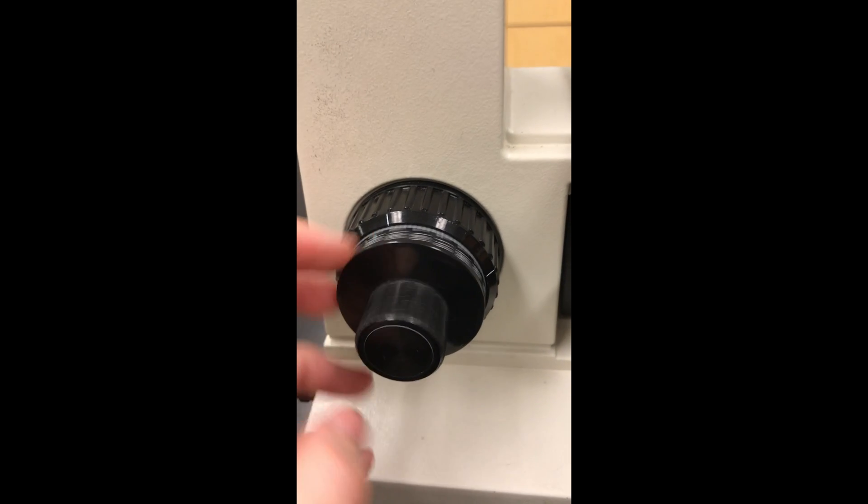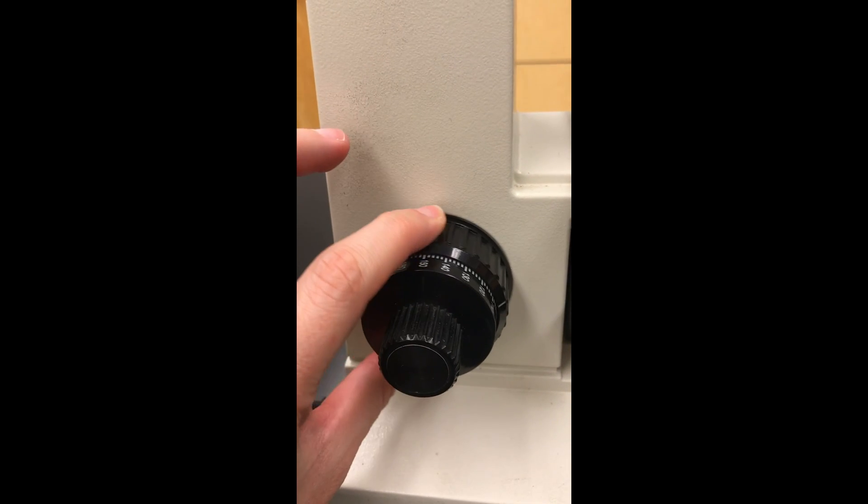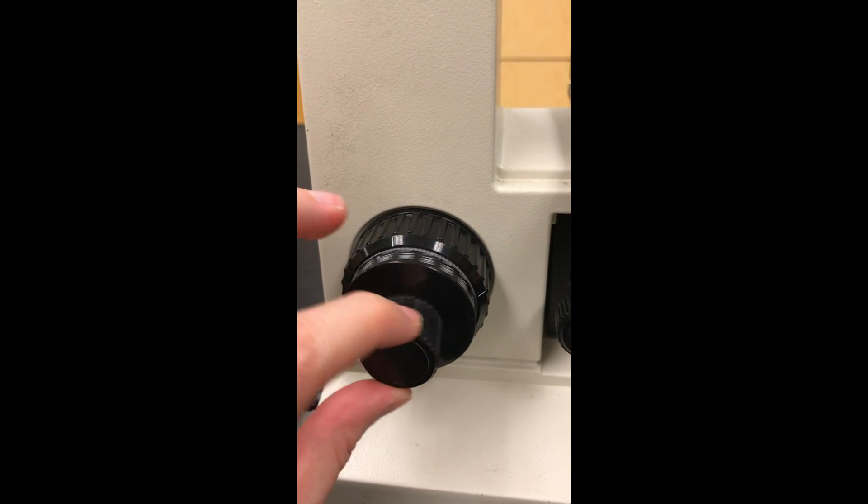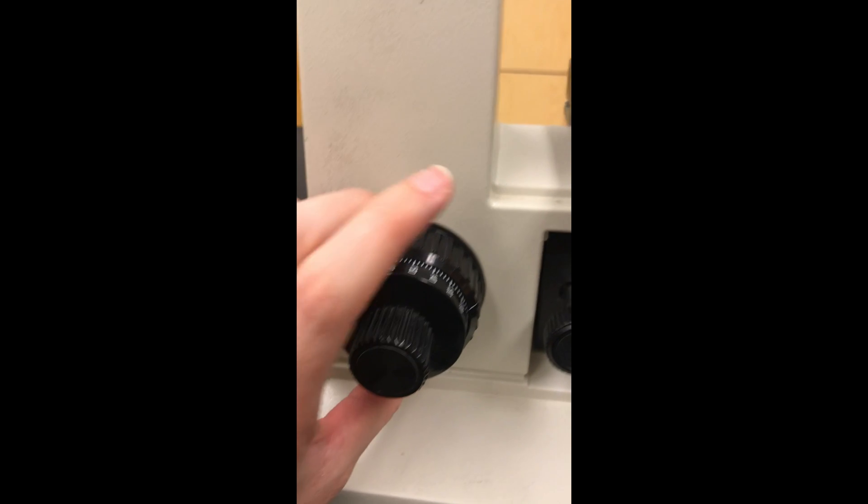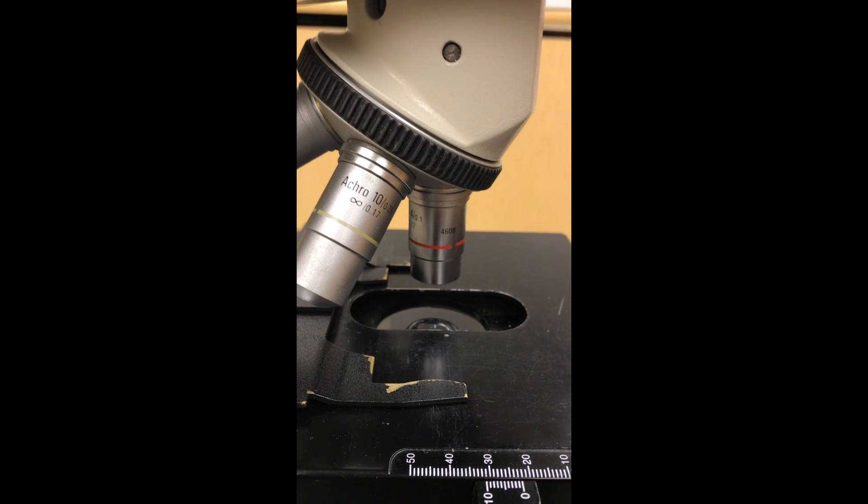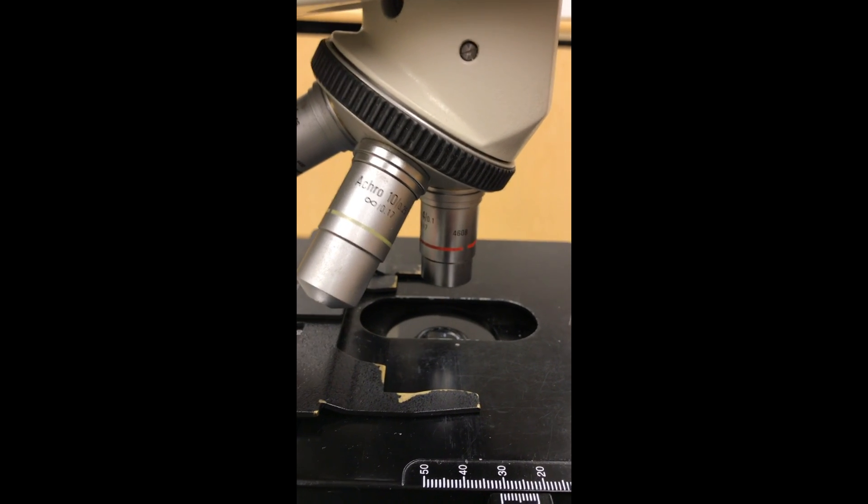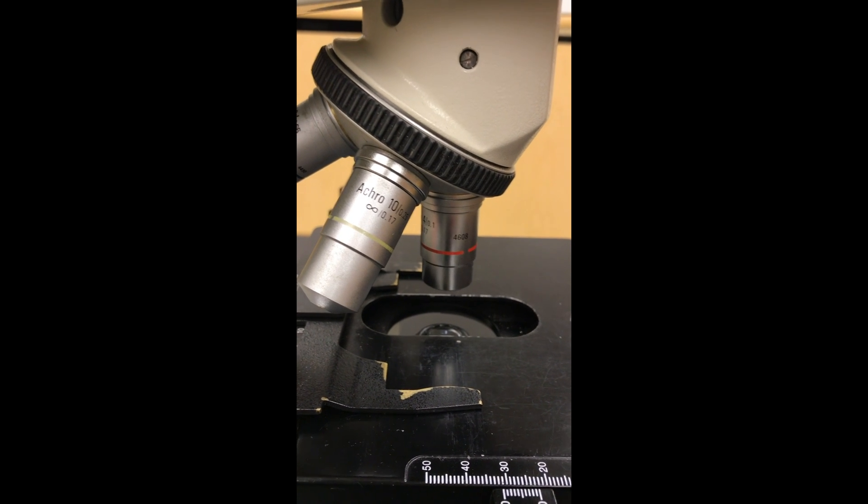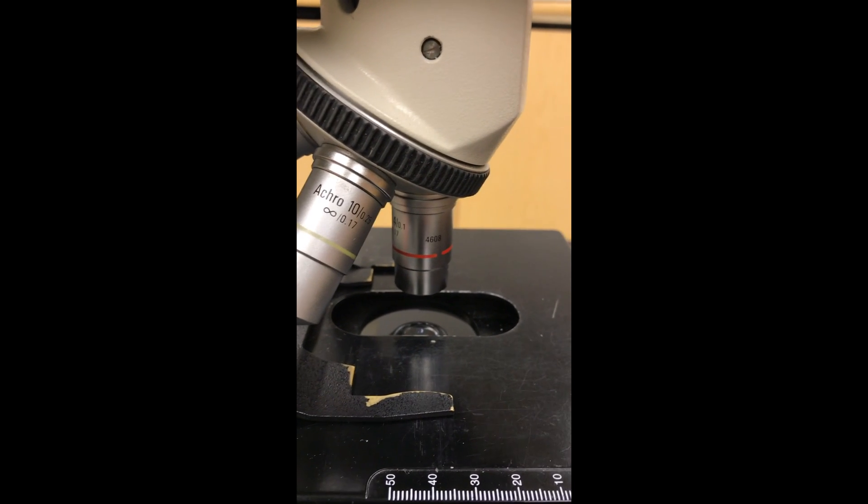You're then going to come over here and you'll see two knobs. The big one is coarse focus. The little one is fine focus. This is what we use in the beginning. So we'll pretend I have a slide in here and I look through my objective. I'm going to use coarse focus. And do you see how much it moves the objectives? It moves them very quickly. So we're going to be able to focus rather quickly.